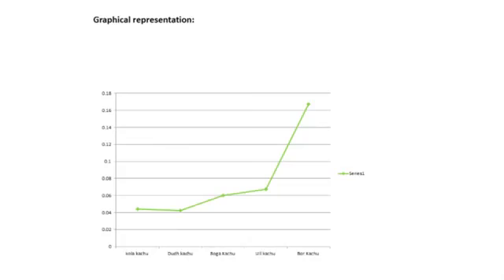So if I analyze the data, then we get a graph like this. In this graph it is very clear that Dus Kosu, which means the Xanthosoma sagittifolium, contains the least amount of oxalate ion, which causes the least itching, and Bohr Kosu contains the maximum concentration, which means it will cause more itching.